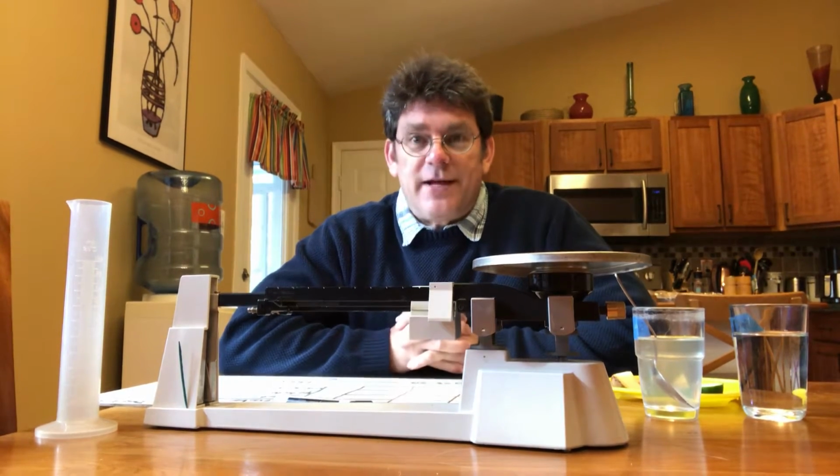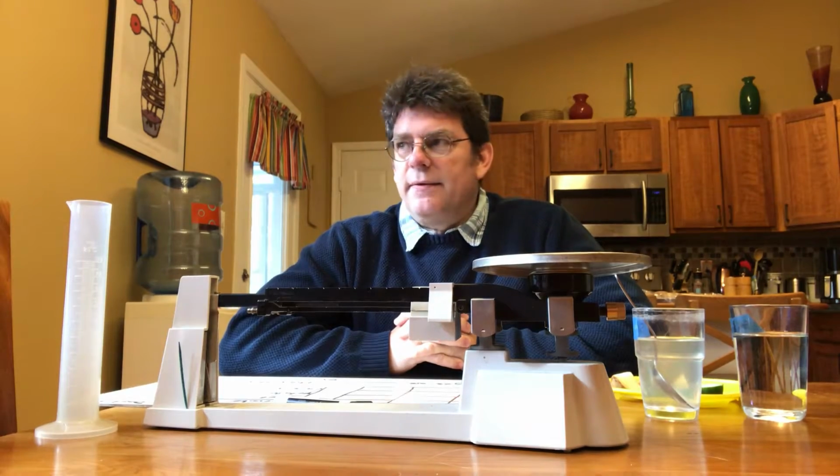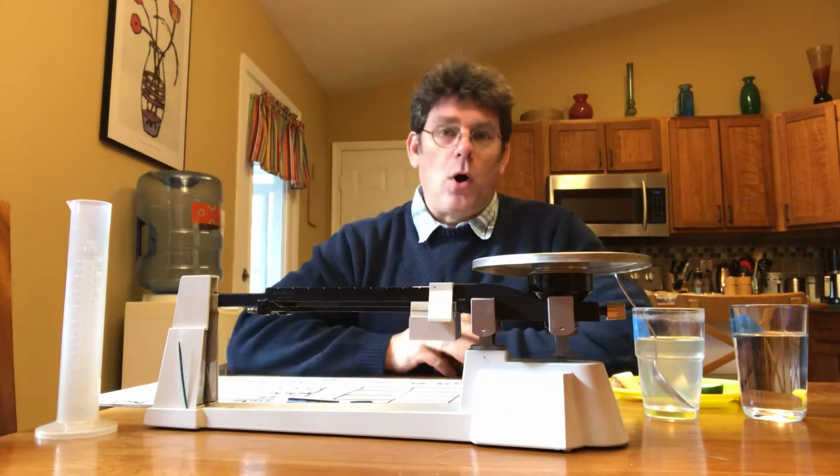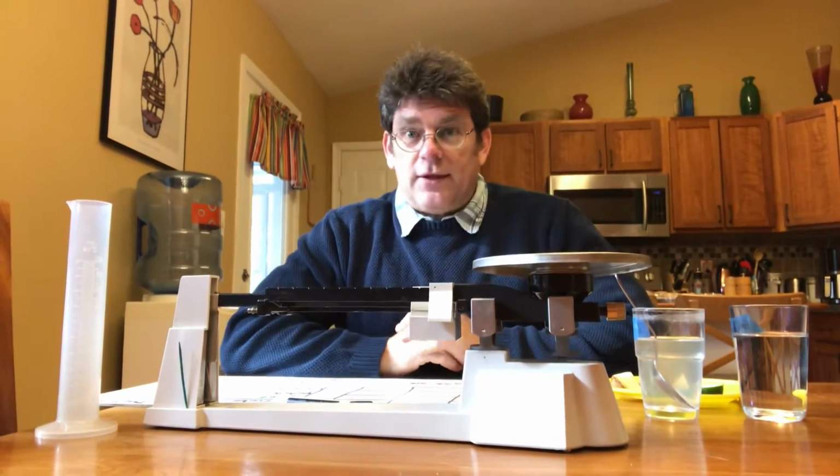Today I'm going to do a quick part one of an experiment about learning target number 8, which is about cell transport. This is really about osmosis and how cells take in and get rid of water and how that moves through the cell membrane. So this will just give you a concrete example of what that looks like, I hope.